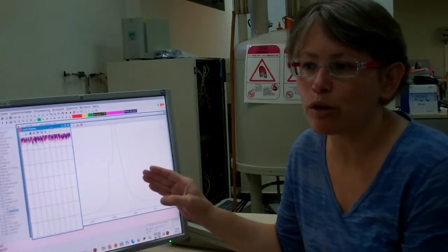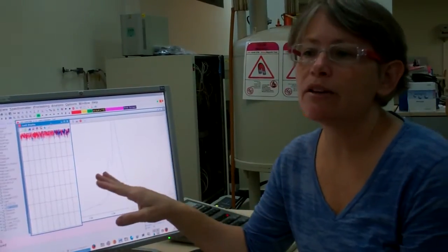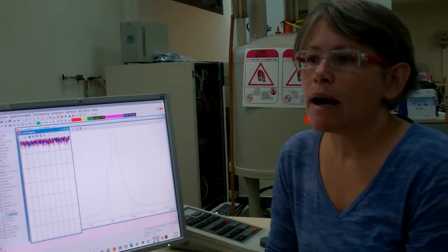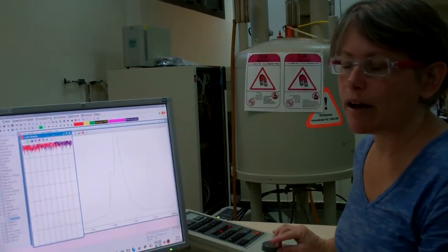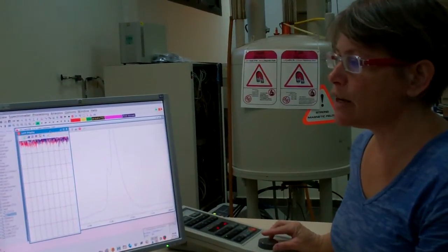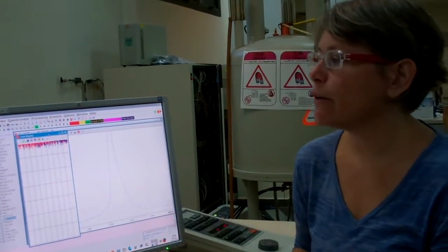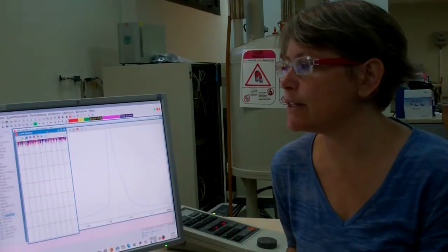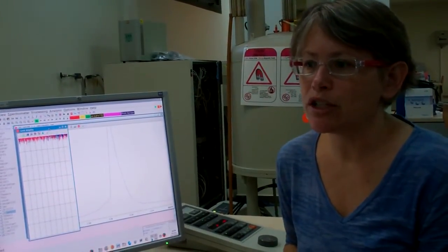I've zoomed in on the chloroform peak. Now we see the inhomogeneity in real time, and here's our lock display. I'm going to shim in real time by pressing Z on the BSMS keyboard and changing the direction. We see an increase, and together with that, the disappearance of the inhomogeneity on the line. That's an improvement in the shim.